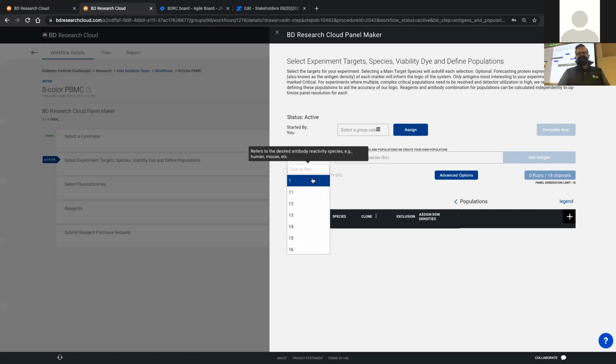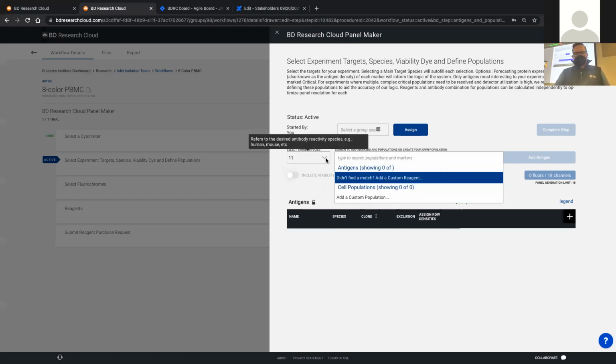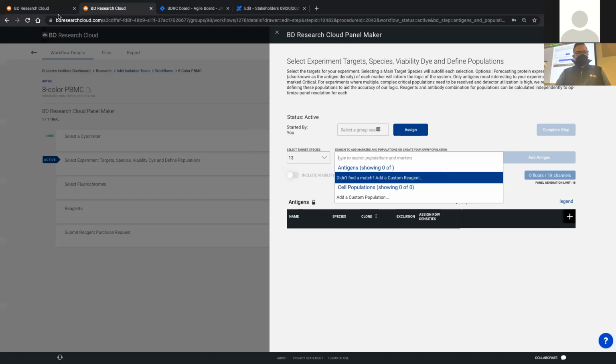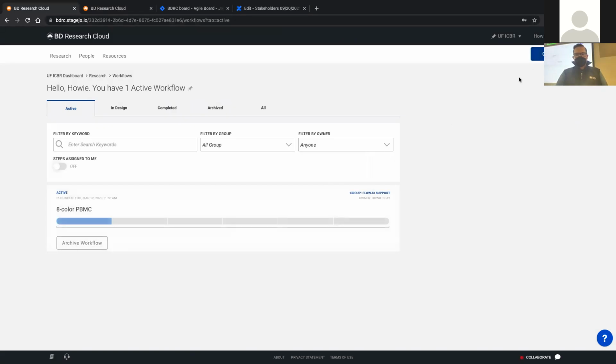So I'm going to say, let's study humans. Oops. It's a code number there. So I'm going to select that population and we're going to have to fix that bug. I'm not sure how to get past that. Interesting. We pushed a new environment to our production server this morning and are having a little bit of a hiccup with that. See if I can't switch back over here and pick up where we left off.